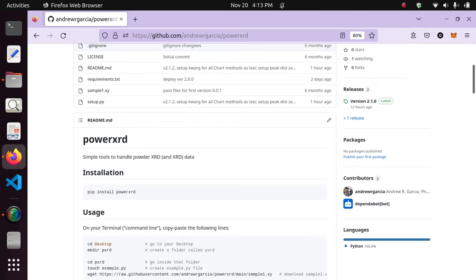As this video states, we'll be calculating a crystallite size and doing some XRD manipulations from XRD data using Python alone. There will be no need to use Origin or Origin Pro for these calculations. If this gains popularity, I'm confident that a lot of people will be using PowerXRD, this Python package, instead of Origin Pro.